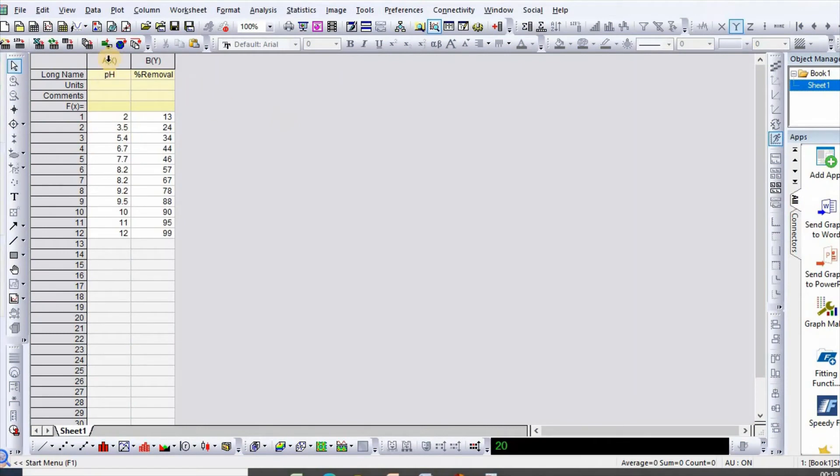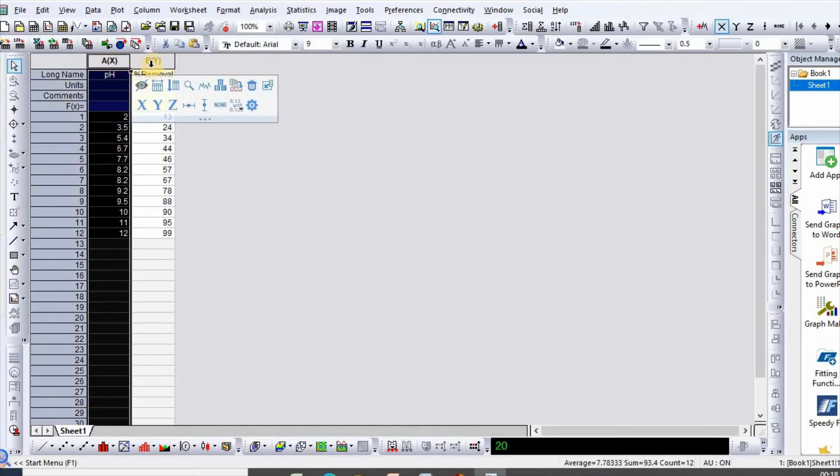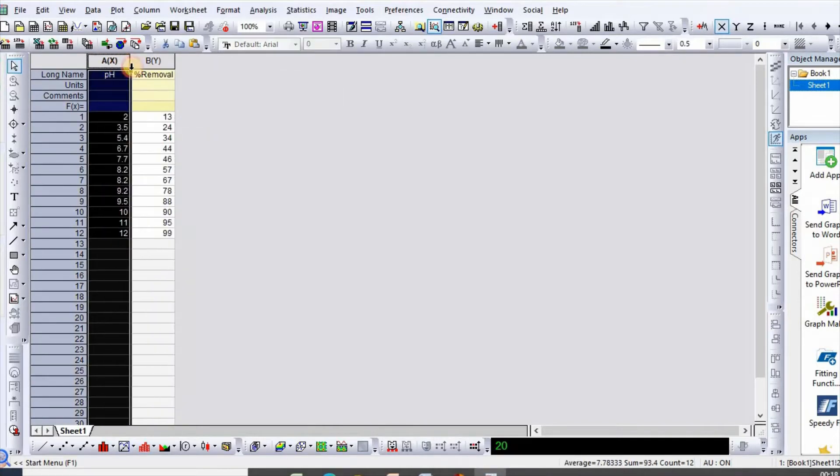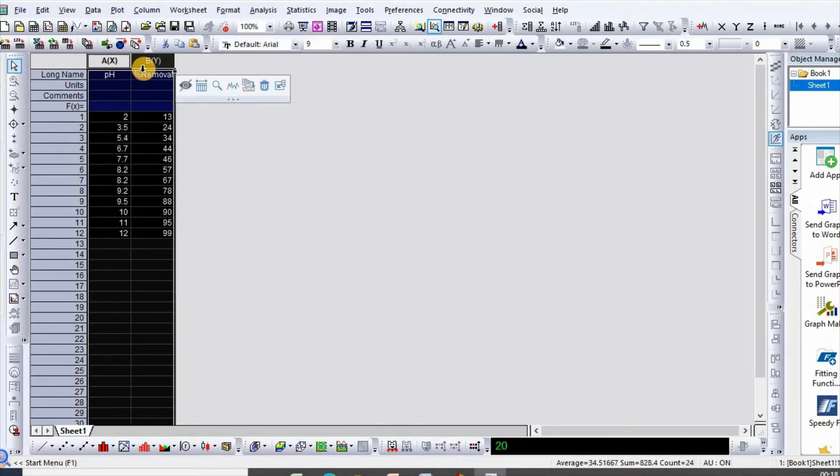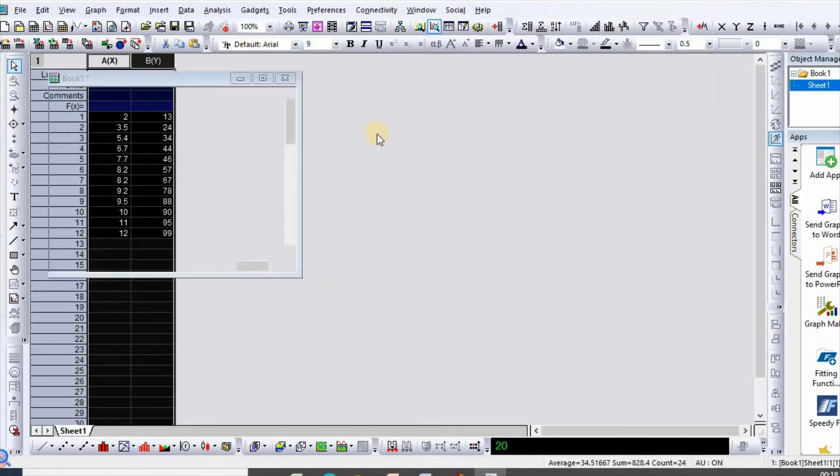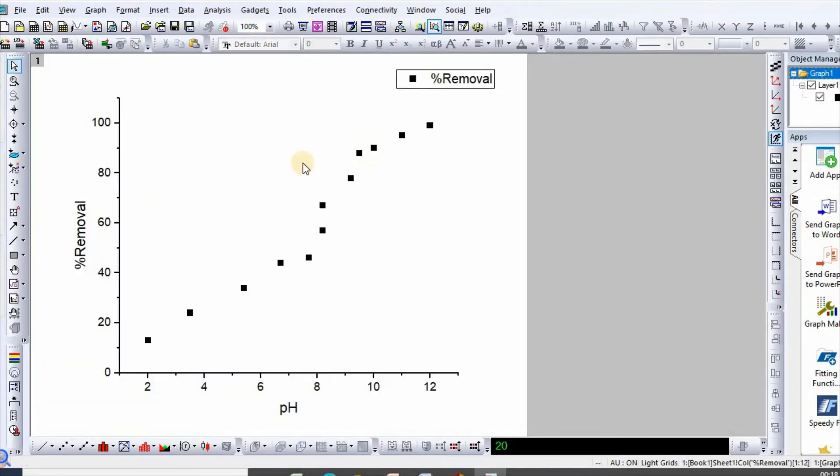In order to do that, I have taken data for ease and percent removal. Then select this column and go to plot, then click on scatter.